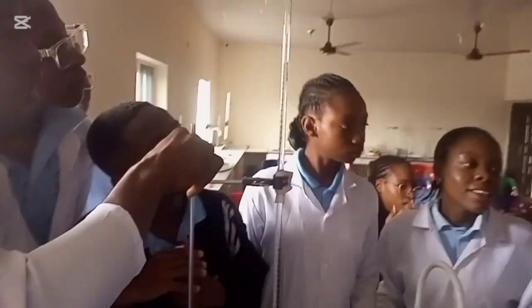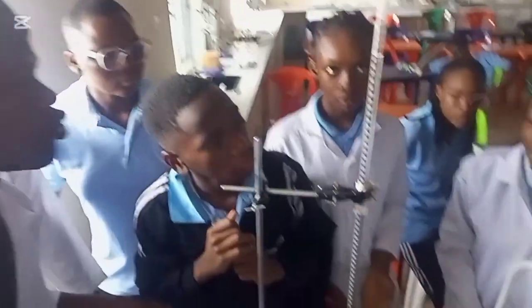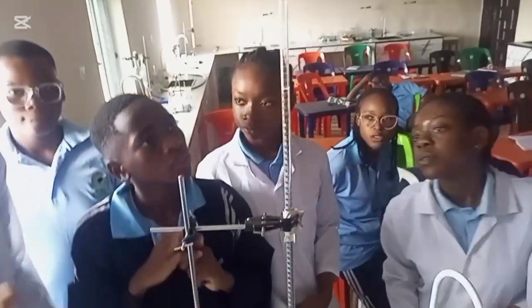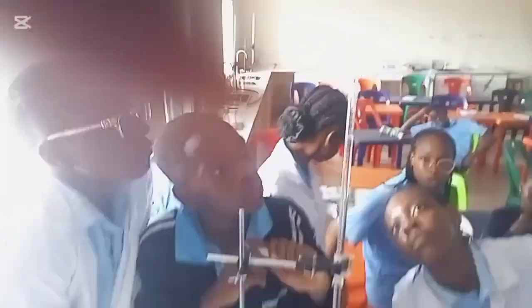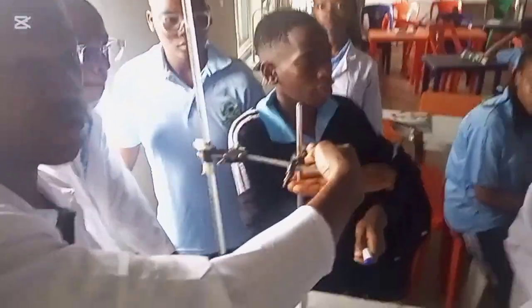Are you reading at eye level? 4.3. It's 4.4. We are looking at the bottom of the concave meniscus. Have you written it?